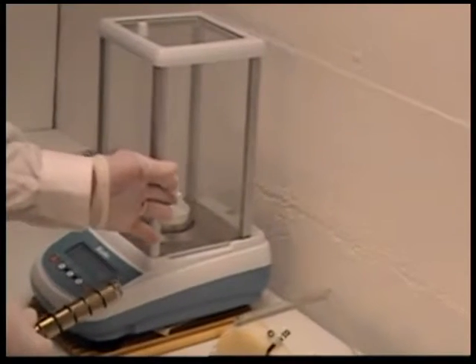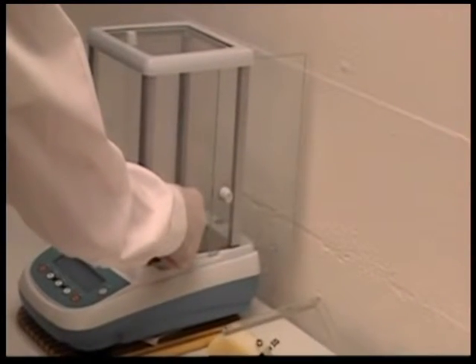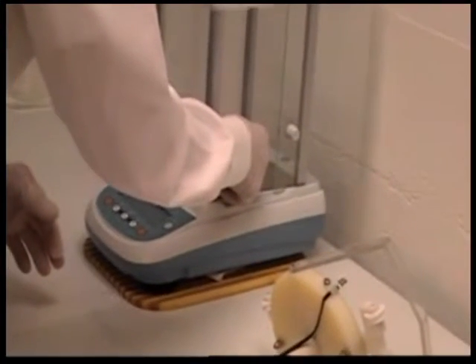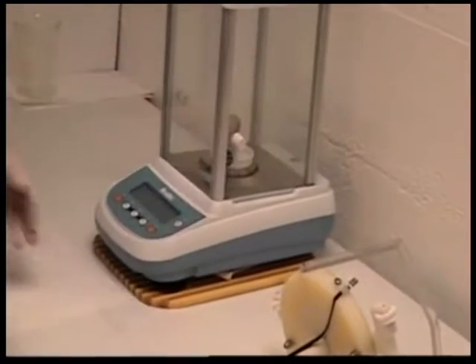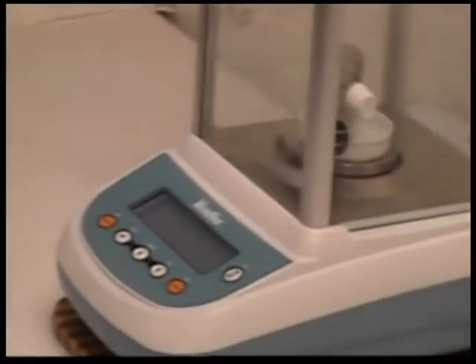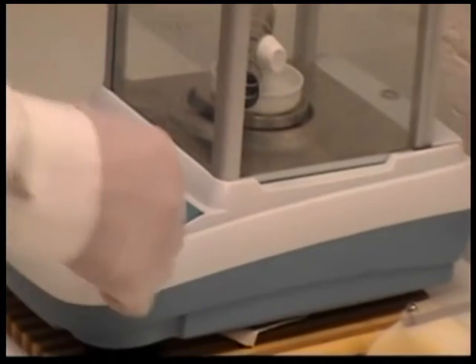Weigh the helix and record its weight in grams. Then mount the helix to the spiral contractometer.